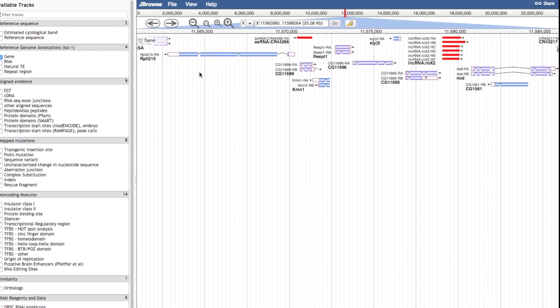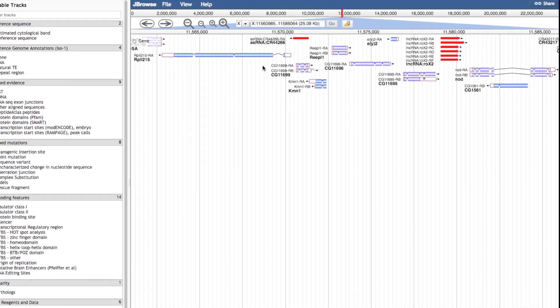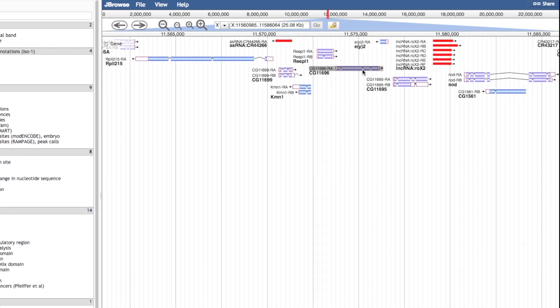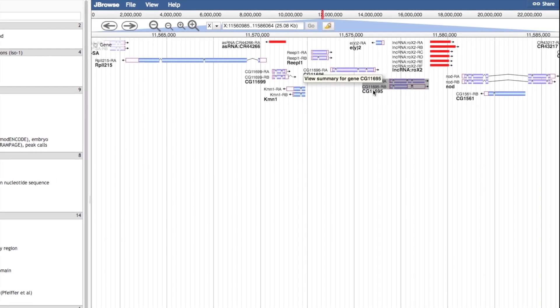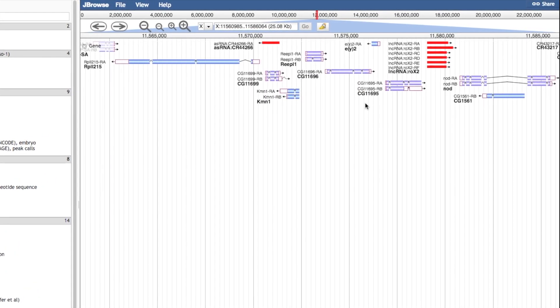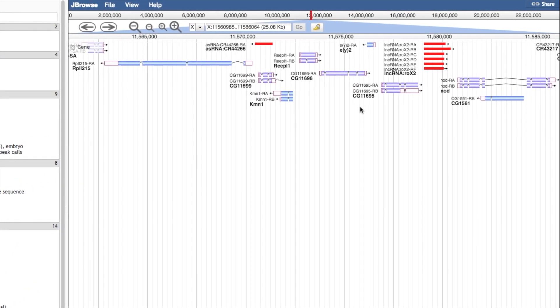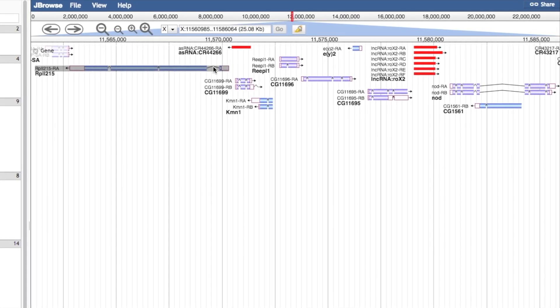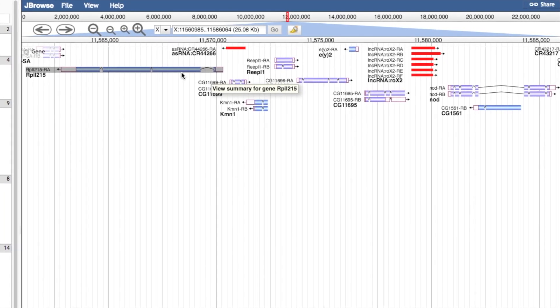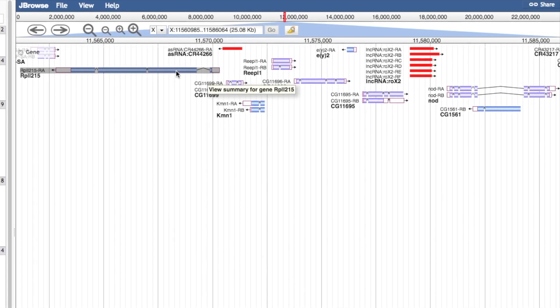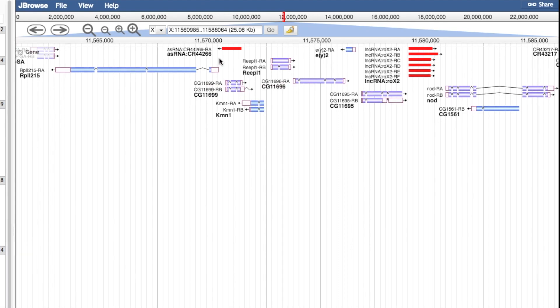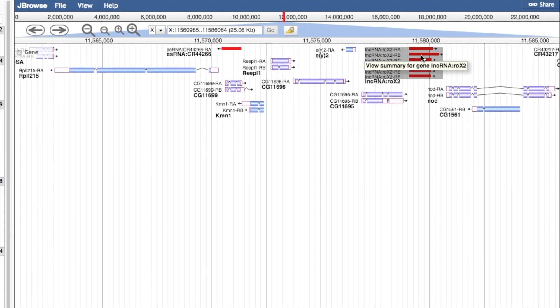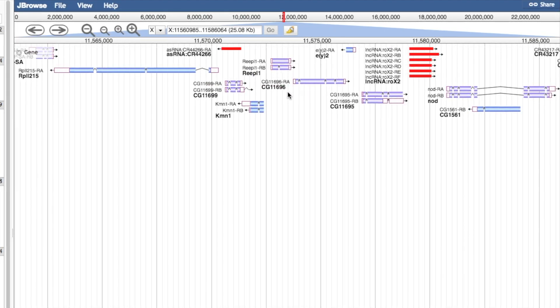The Gene track shows all annotated genes, including non-coding genes, with direction of transcription indicated by a small arrow. For each gene, all transcripts are shown with the complete intron and exon structure. Non-coding genes are shown in red, and blue and purple genes are on opposite strands.